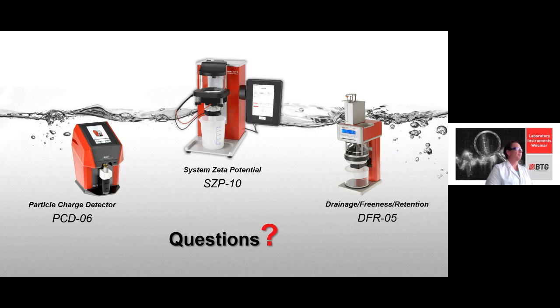Todd, indeed, there is a protocol for the cleaning in place, and it involves some chemistry also, some detergent, some acetone, and a salt is mixed into this cleaning recipe as well, making this our, let's say, bread and butter cleaning solution.